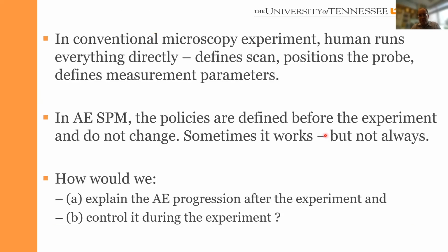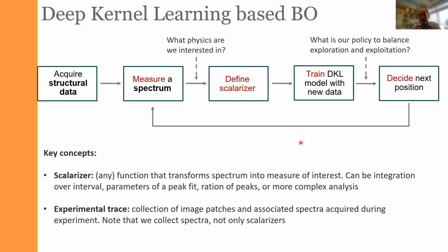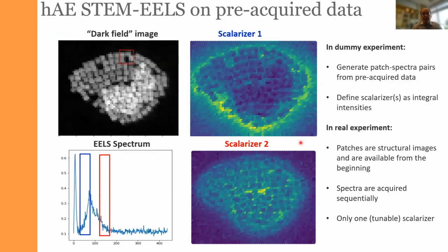So what we need is monitoring signals. The problem is, of course, that if we try to do something like this on a real-world microscope, this is not the most conducive environment for development.